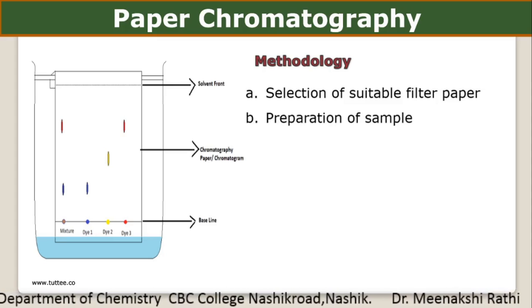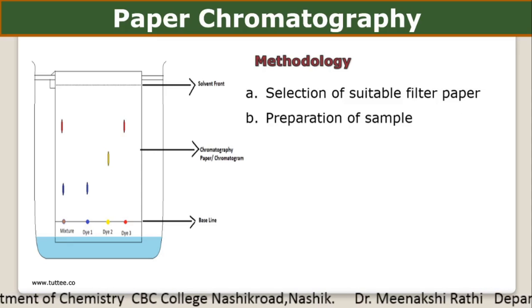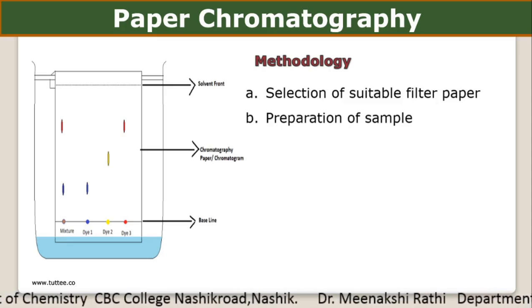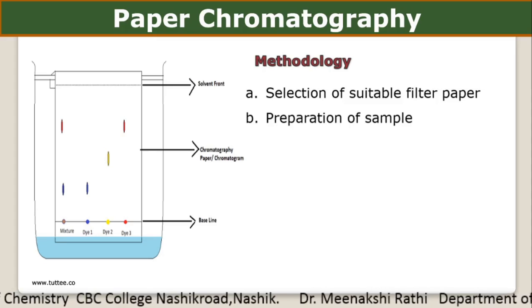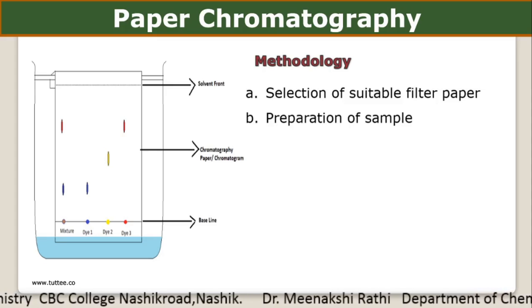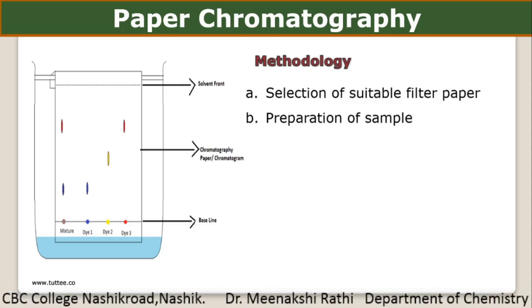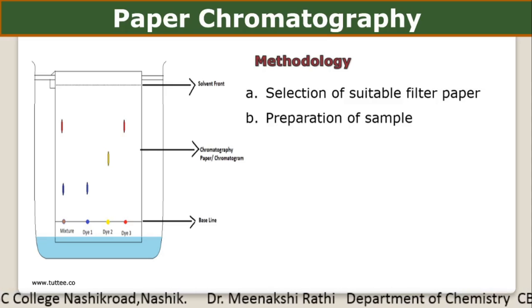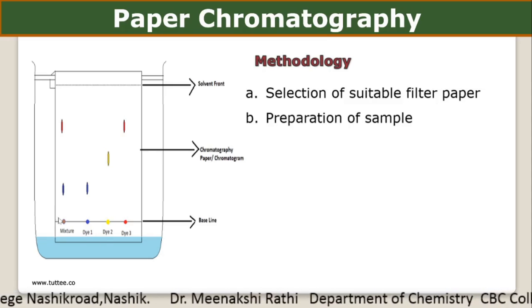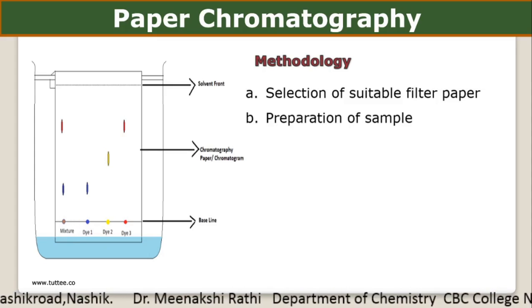The second step is preparation of sample. Preparation of sample involves the dissolution of the sample in a suitable solvent. The solvent which is used should be inert so that the solute cannot react with the solvent. So if we want to analyze a mixture, it should get dissolved in a proper solvent.